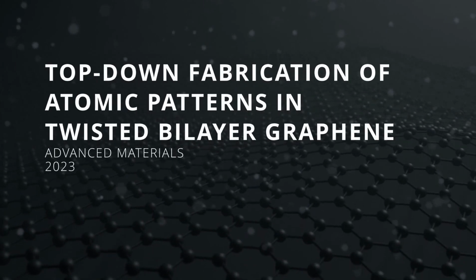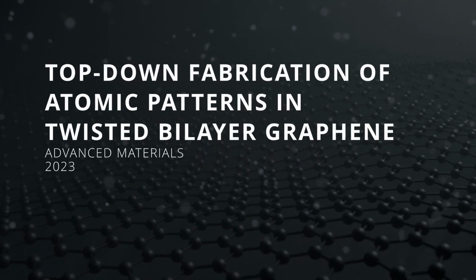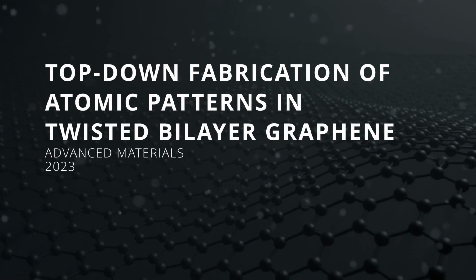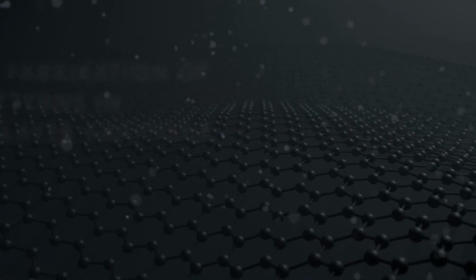Top-down fabrication of atomic patterns in twisted bilayer graphene. This manuscript was published in the journal Advanced Materials in 2023.